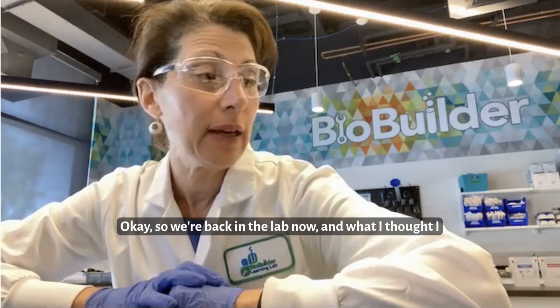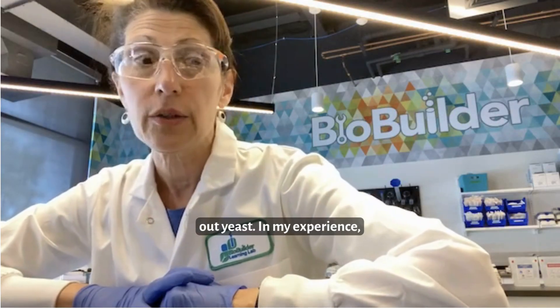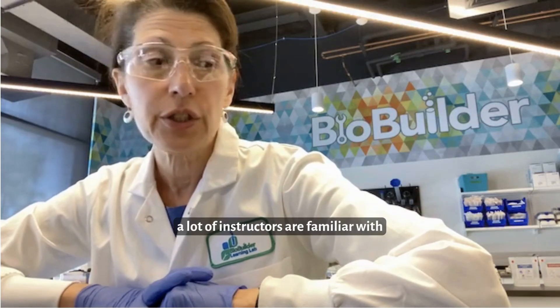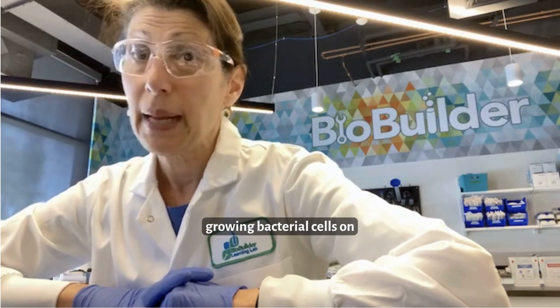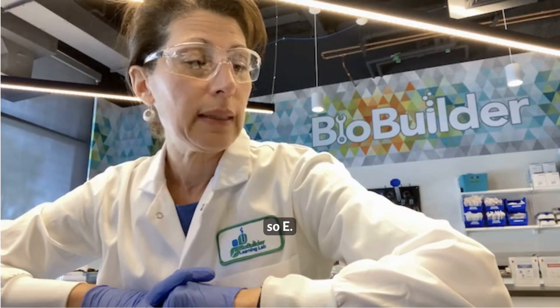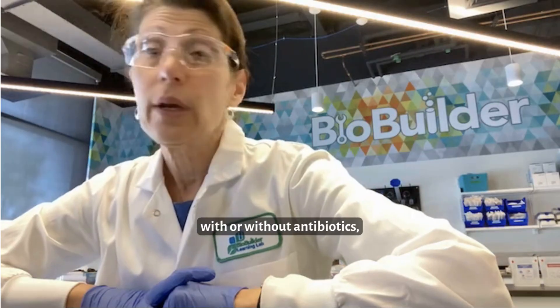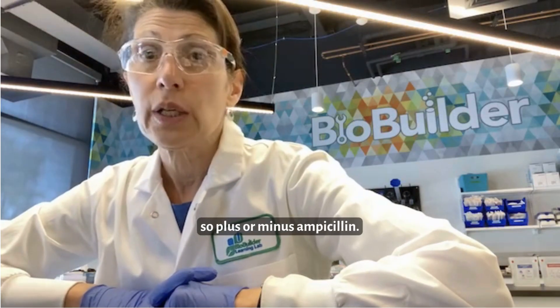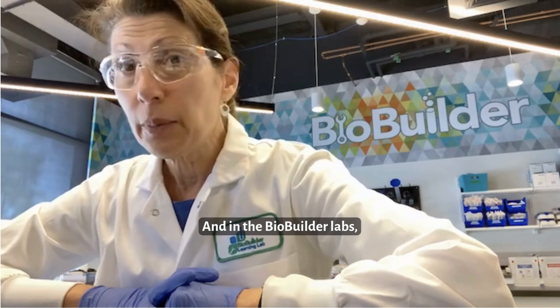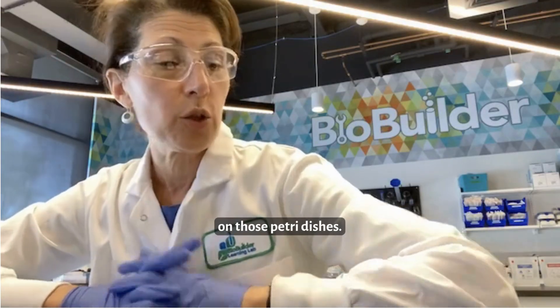So we're back in the lab now. I'd like to show you two ways to streak out yeast. In my experience, a lot of instructors are familiar with growing bacterial cells on petri dishes — E. coli on Luria broth, LB, with or without antibiotics, so plus or minus ampicillin. In the BioBuilder labs, there are two ways that we grow cells on those petri dishes.